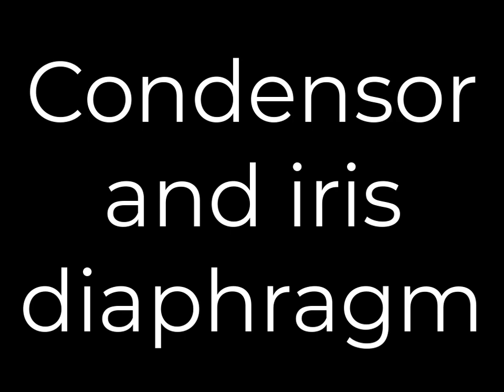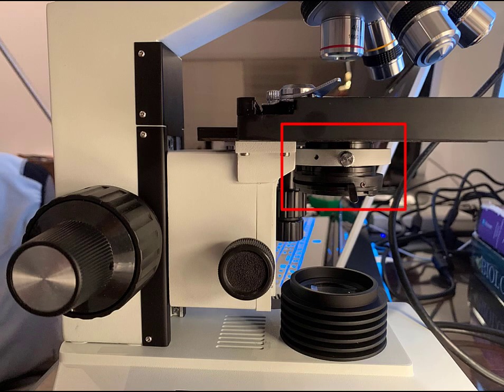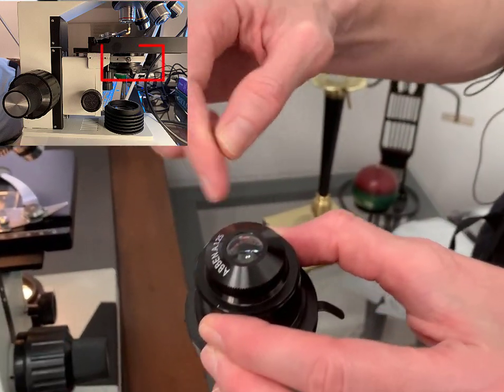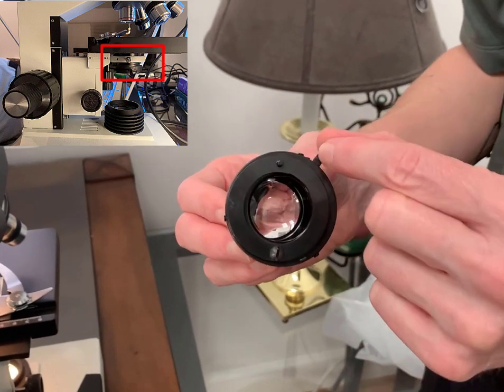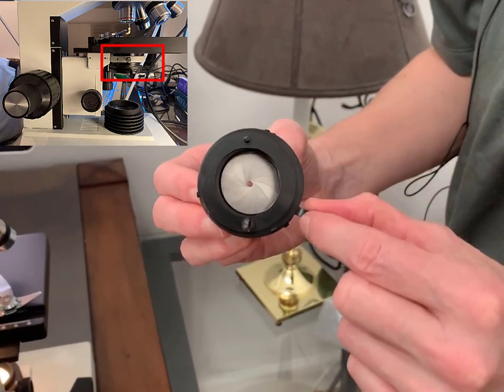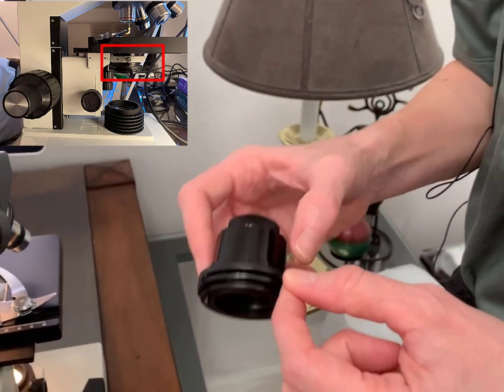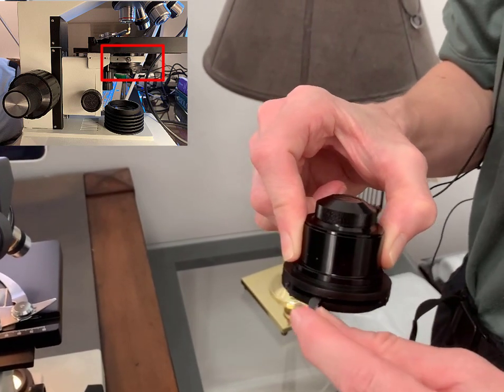Now let's have a closer look at the condenser and the iris diaphragm. Both of them are contained within a housing that sits directly under the stage. On my microscope, I can remove this and show you the actual lens, which is the condenser. The iris diaphragm is a set of metal leaves that controls the size of the aperture, which in turn controls the amount of light that is able to pass through the slide from the sub-stage light. The iris diaphragm is controlled by the iris diaphragm lever.